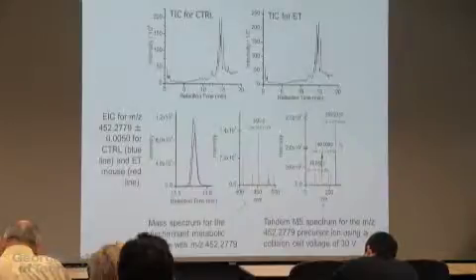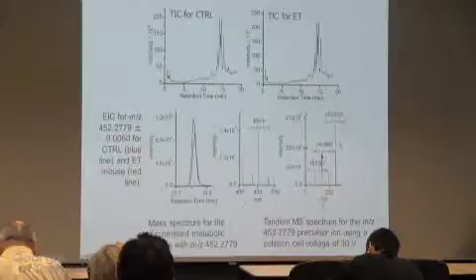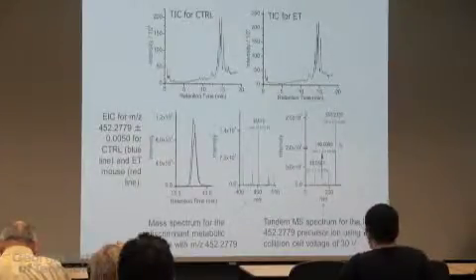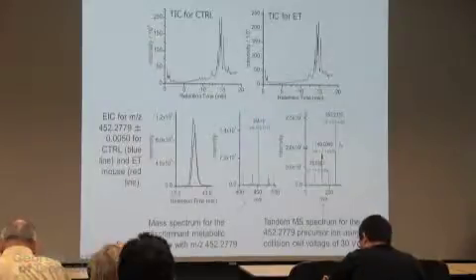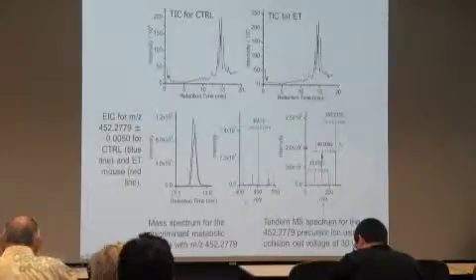Furthermore, the mass alone is not enough. What you do is you select this molecule. The time of flight has a way of selecting a specific ion, and you fragment it. You break it into parts, and you measure the masses of the fragments. And then you start putting this puzzle together. If you're lucky, you're going to be able to search this in a database. But databases for metabolomics are not there yet. They're growing, but they're not complete.